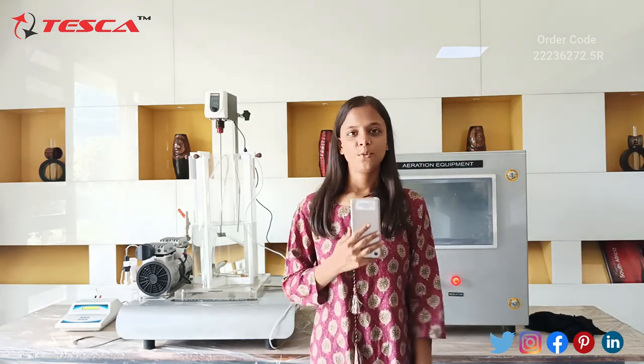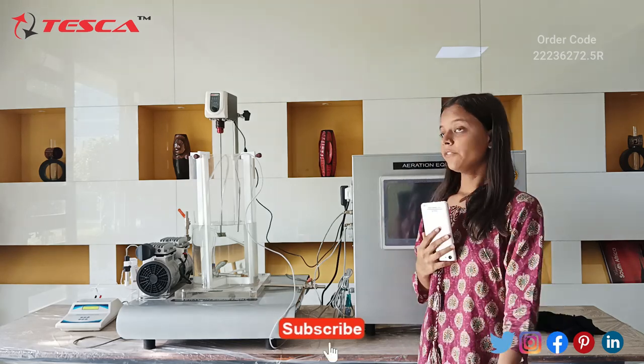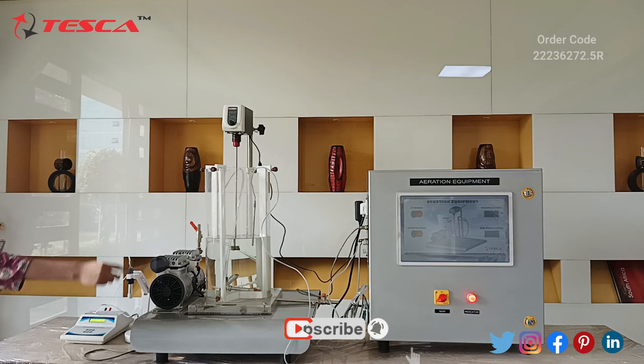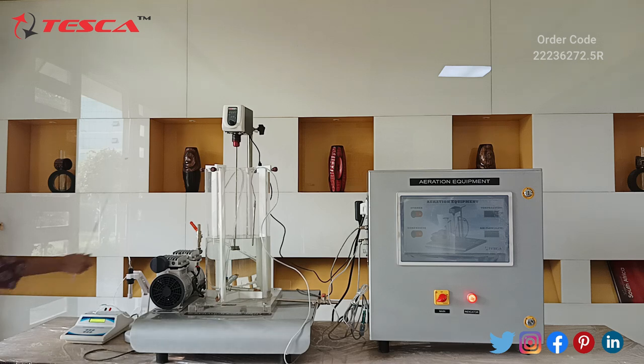Hello everyone, welcome to TSCA Technologies Private Limited, Jaipur. My name is Monika and today we will be learning about aeration equipment. Let's learn about this aeration equipment's components. We start with the DO temperature meter.